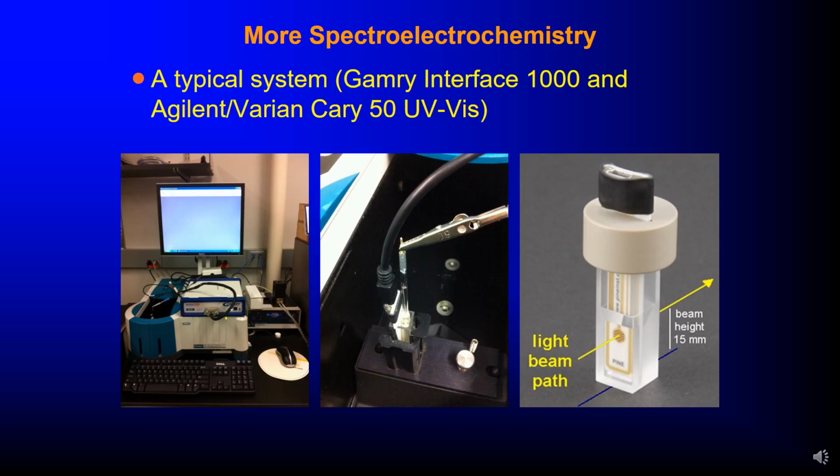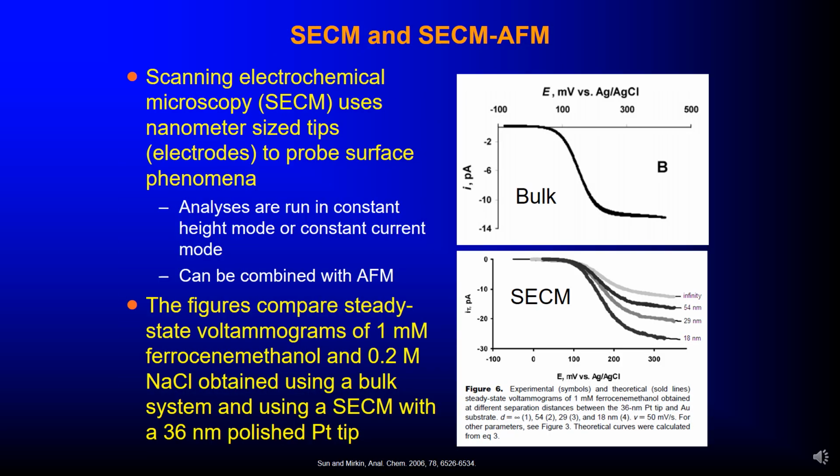Analyses are run in constant height mode or constant current mode and can be combined with atomic force microscopy. So you can see a typical system here.